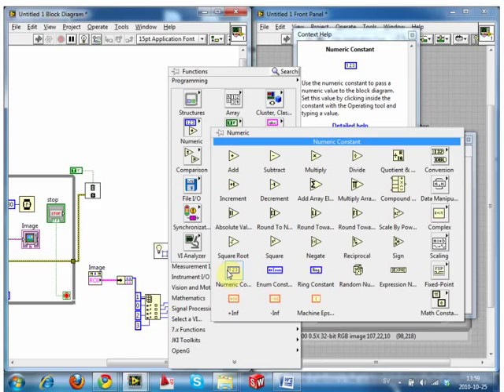So I didn't get the question about constants very clearly. What's that? They're just 1, 0, 2, 3. For example, there is a rectangular area we choose in the image. So what does the 1, 0, 2, 3 mean in this kind of region? Right, so you've got an array of numbers.